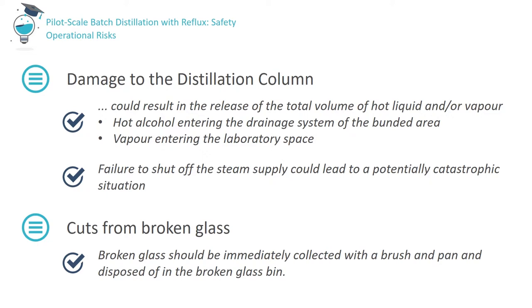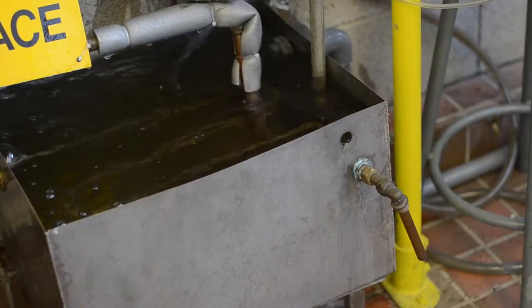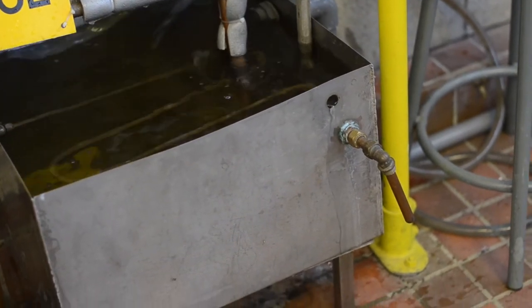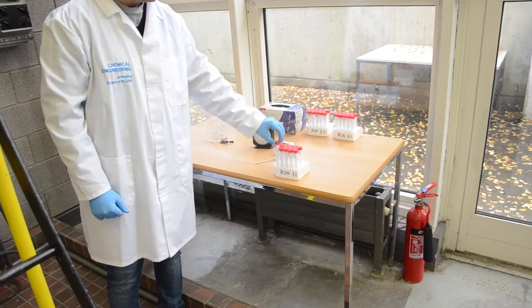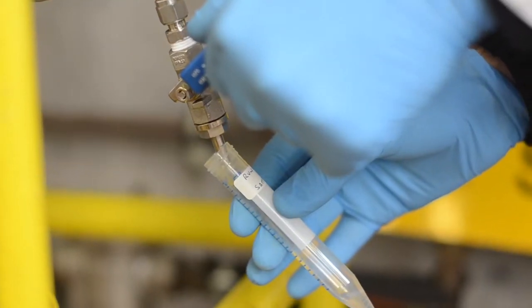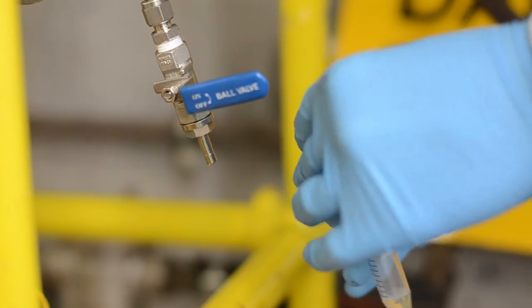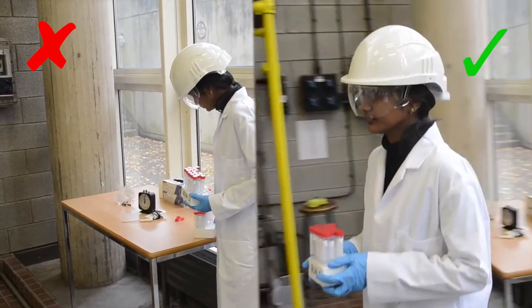To reduce the risk of cuts in the case of broken glass, fragments should be immediately collected with a brush and pan and disposed of in the labelled broken glass bin. The surface of the working area surrounding the column can become wet for any number of reasons, increasing the risk of slipping. Overflow from the cooling water and steam condensate tank may result in a wet surface in the bunded area — take care. There is a possibility of splashes and spills whilst collecting samples and/or transporting them for analysis, so open the sample valve slowly when collecting a sample and cap the sample vial immediately afterwards. Never carry materials in an open container, and ask for assistance when trying to turn door handles while carrying materials.